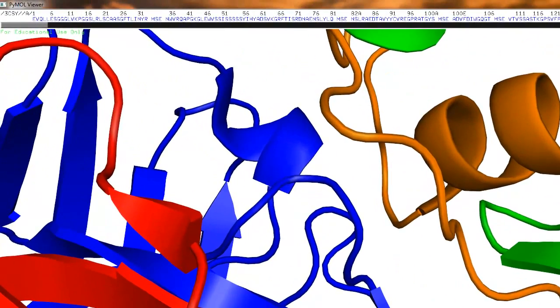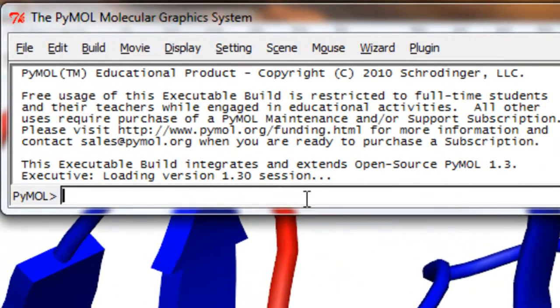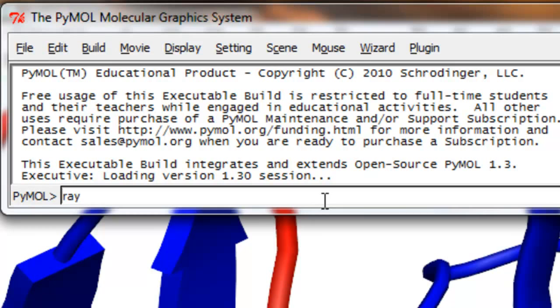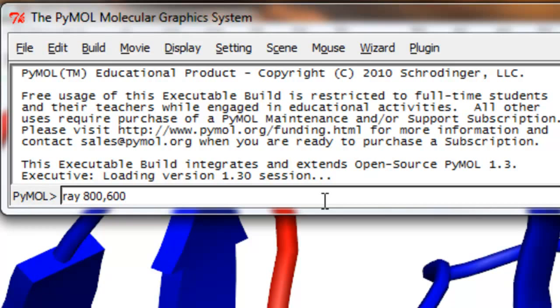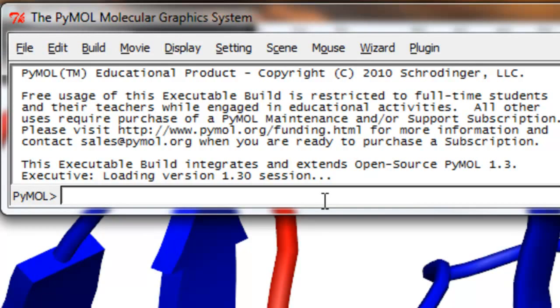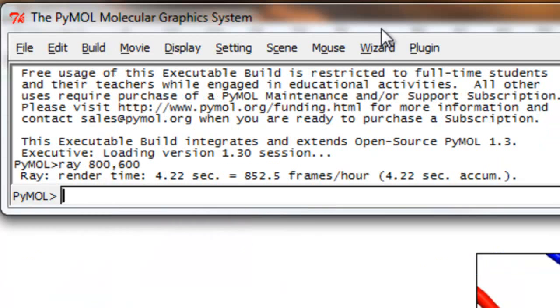Now we're going to enter a very simple command in this bar here, this menu bar. And we're just going to call ray. So we're going to enter ray 800, 600. Now what this means is that I'm going to tell the program and then my computer basically will render this image with the width of 800 pixels and the length of 600 pixels. Basically width and height I should say. So the first number is width, the second number is height. Now we're going to go ahead and press enter. And there we go. Perfect. And this basically took 4.22 seconds, I believe.